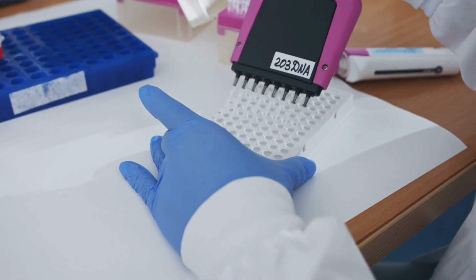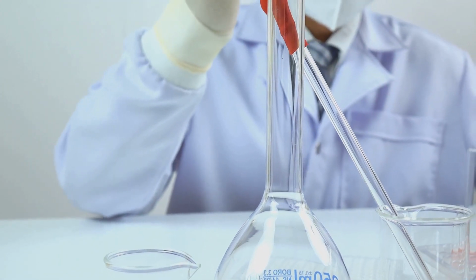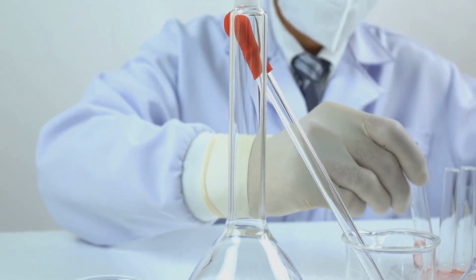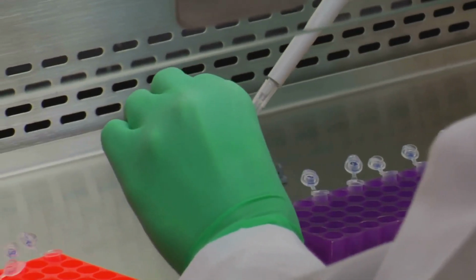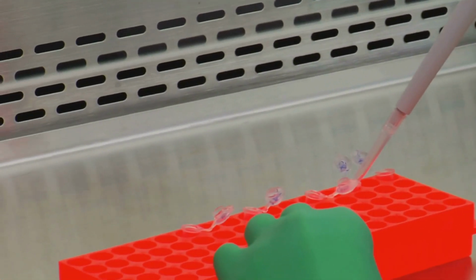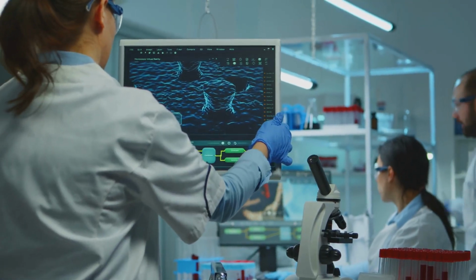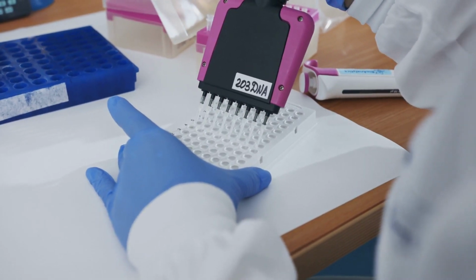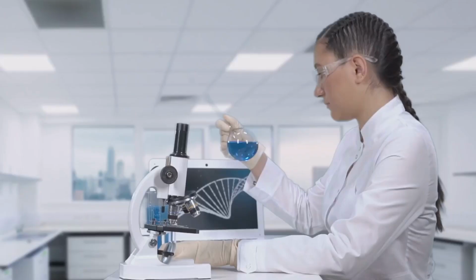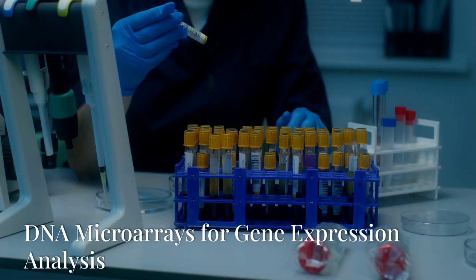Digital PCR. Digital PCR is a sensitive technique used for absolute quantification of DNA molecules. It partitions a DNA sample into thousands of individual reactions, allowing the detection and counting of specific genetic variants. Digital PCR is particularly useful for detecting rare genetic variants and accurately determining their abundance in a sample.